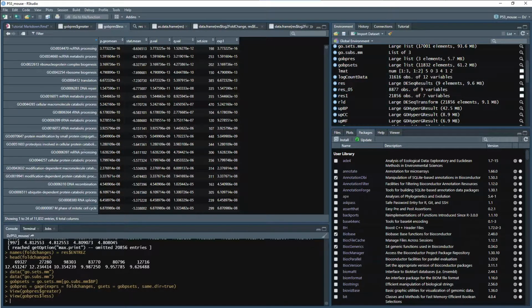So we have less messenger RNA processing, so that can make sense. Less translation, less DNA repair, kind of harder to wrap your head around, but non-coding RNA, DNA recombination, RNA splicing, some interesting stuff happening. So if we go back and clear a lot of this out.